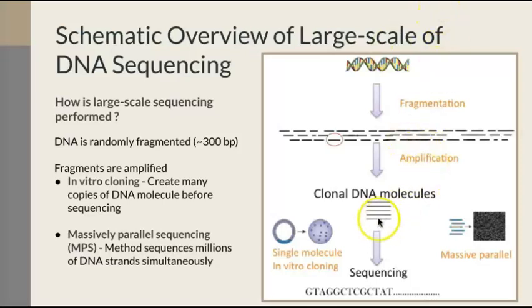When we amplify our DNA, RNA polymerase and DNA polymerase at times can have a certain bias with regards to which sequences they prefer to elongate or replicate compared to others. So downstream, when you're doing your analysis, that's one of the things to take into consideration, if you see many duplicates of certain sequences relative to all the other sequences.